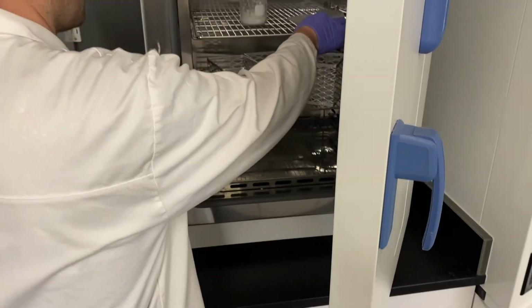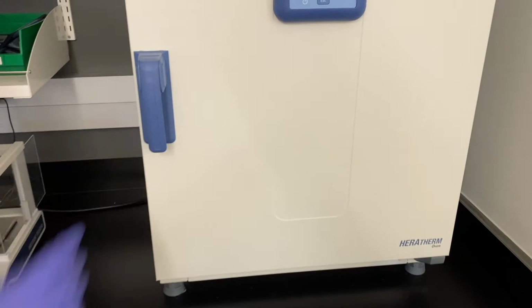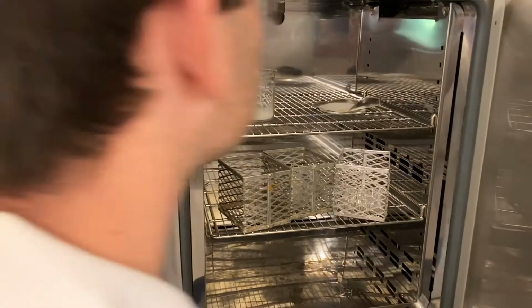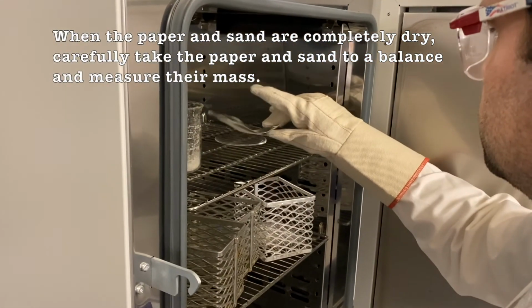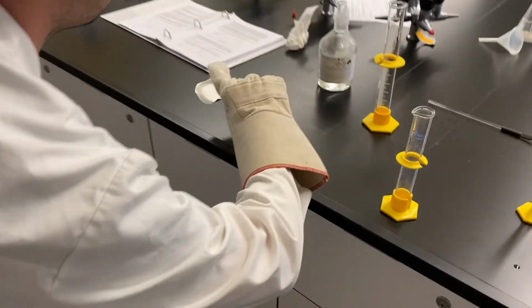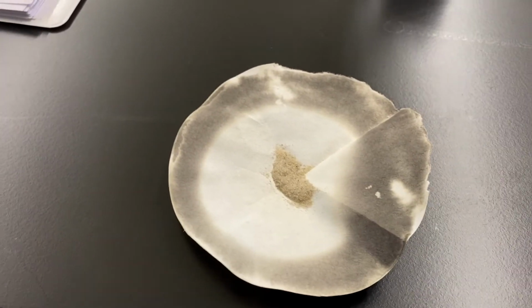Because if we weighed it with the water also, we would get a very big error because water does weigh something. And one thing you do have to be wary of when you're drying filter paper like this, you don't want to burn it. And you can see we crisped it a little bit, and that's okay, but you definitely don't want to burn it to the point where you have holes in it or you're missing some of the filter paper because, again, that's going to throw off your results. Even having that little bit of charring, it will lead to a little bit of error, but you should still get really good data.